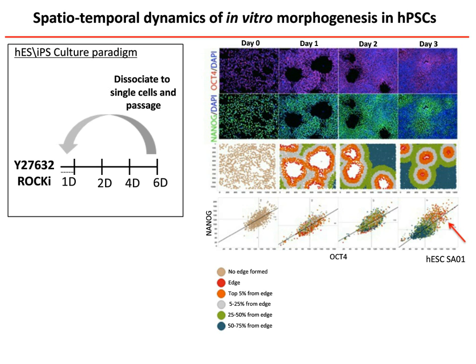What we noticed during time in culture, that is after passage, is that there's a reorganization of a transcriptional hierarchy. In the top row, we're showing a 4-day time course, where one sees red stain indicating OCT4 levels, and just below that, green stain indicating NANOG levels.